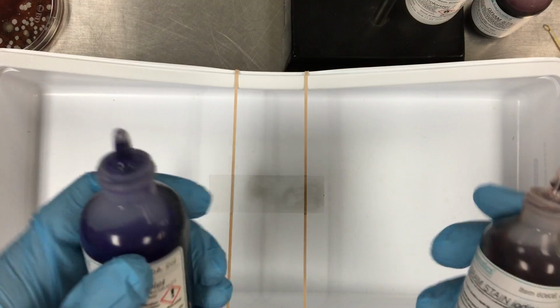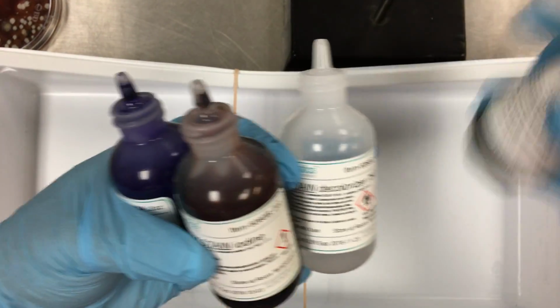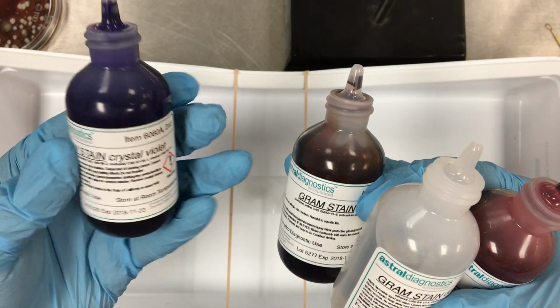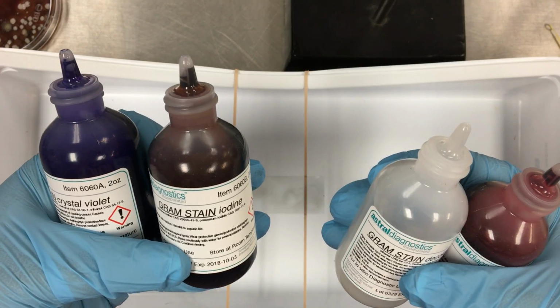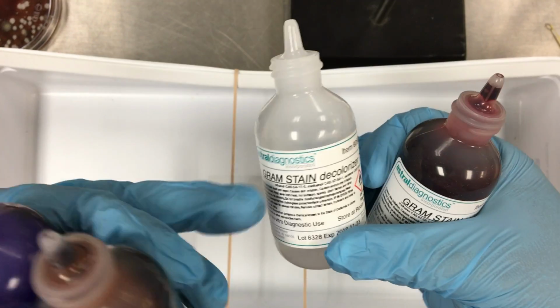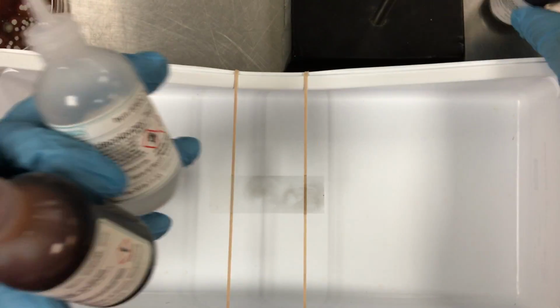And the gram stain procedure consists of 4 things in a very particular order. So first we have the crystal violet stain. Next we have the gram stain iodine, which is the mordant that seals in the crystal violet. Then we have the acetone decolorizer, and then the counter stain, which is safranin.